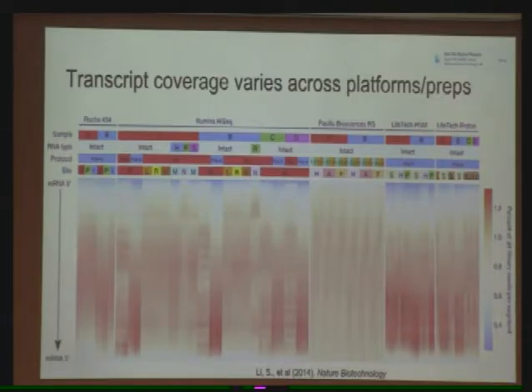I'm sorry, when you say bias, what does that mean? Looking at different genes on top, and then these different colors, I wasn't completely sure. Yeah, sorry, I didn't explain that so well. So this right here is the length of your transcript from the gene that you're interested in. This is like the beginning of it and the end of it. And what you're interested in is how many reads you got that mapped to the different places along that transcript.